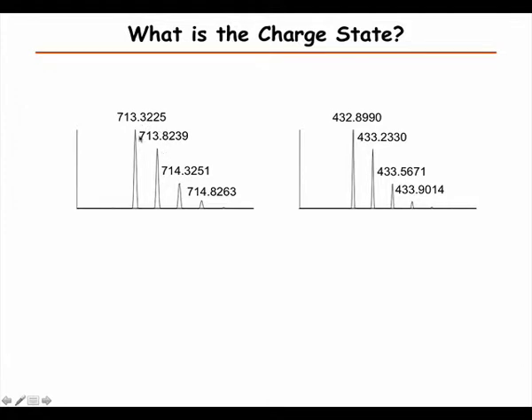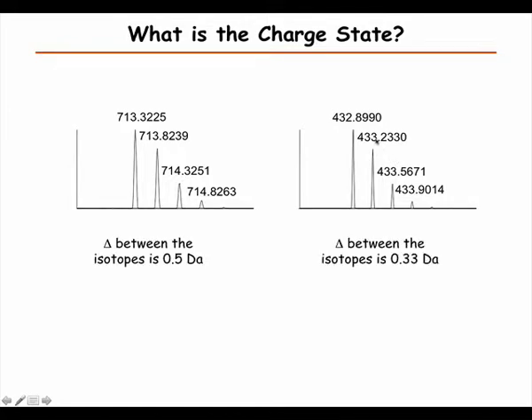So there's a 0.5 difference between these, so it's a 2 plus. And then here we have 0.3 spacing, so that's the reason.